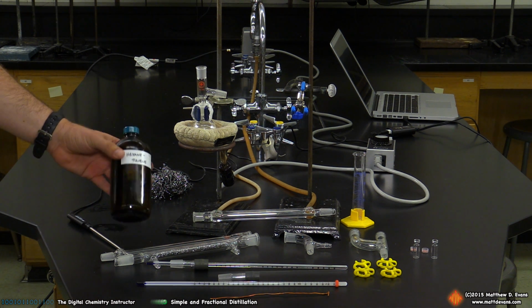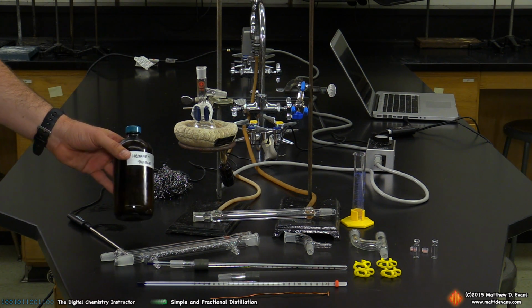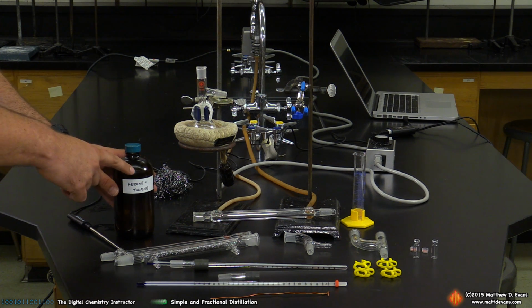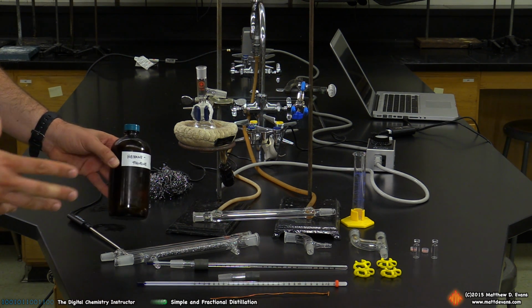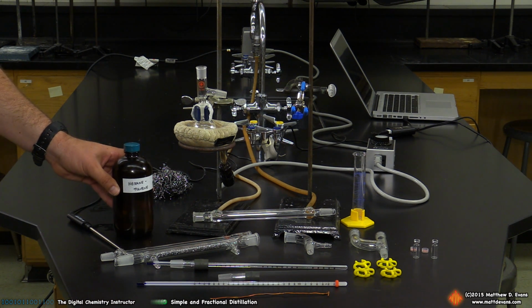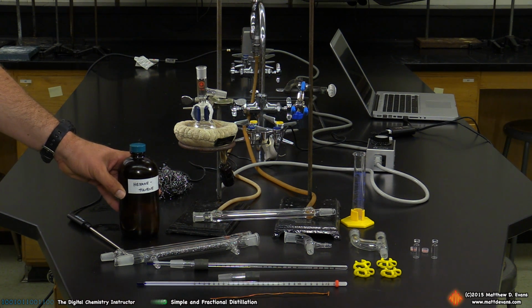We're setting up for a distillation, two types of distillation. We're going to do what's known as simple distillation and fractional distillation. You are going to truly grab an unknown mixture, although what I have here, I know what the components of this mixture are. This is hexane and toluene mixed together in 50-50 proportions, but you're truly going to have an unknown mixture. And you're going to get a chance by distillation to separate these two components of this mixture away from one another, determine their boiling points, and identify what those compounds are.